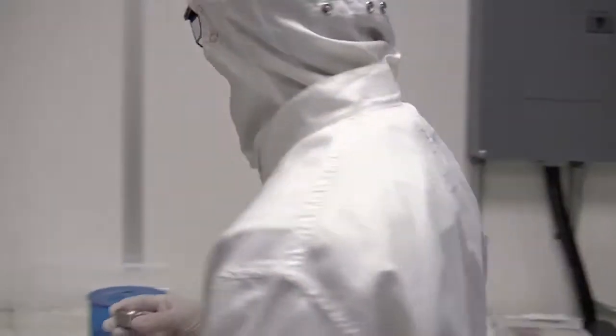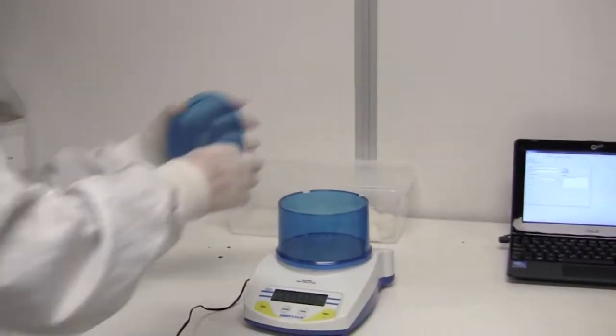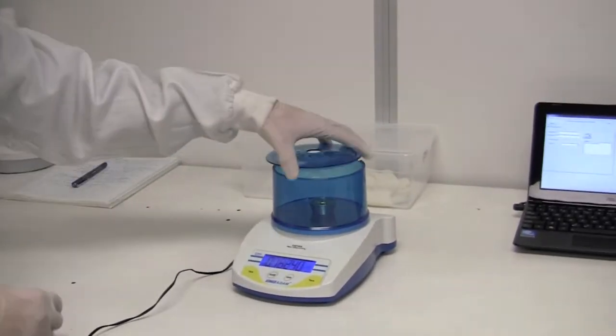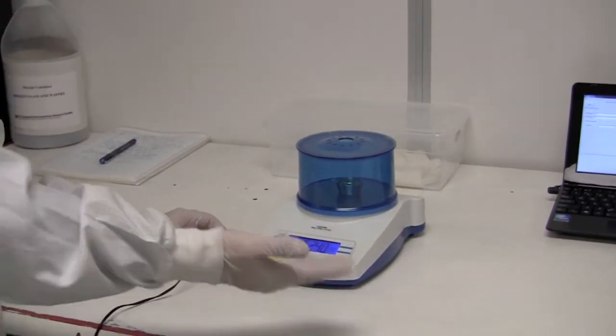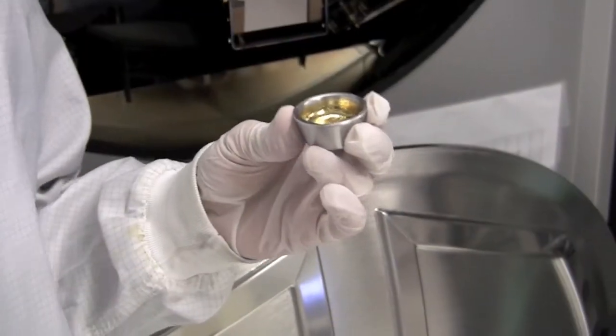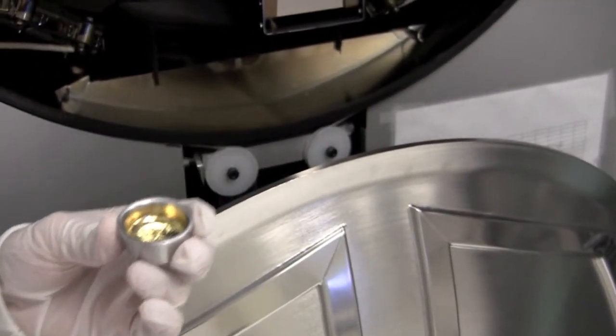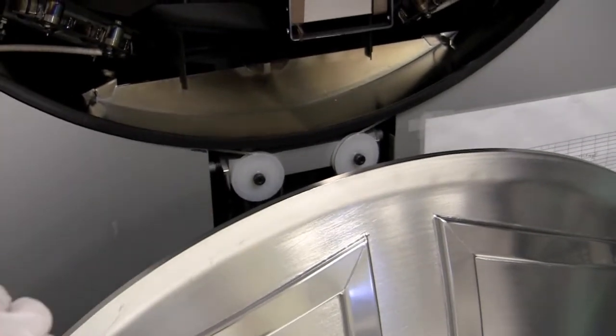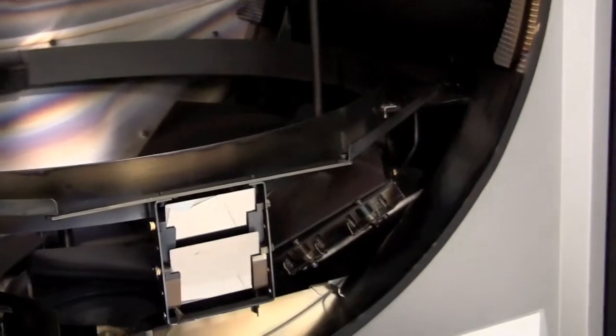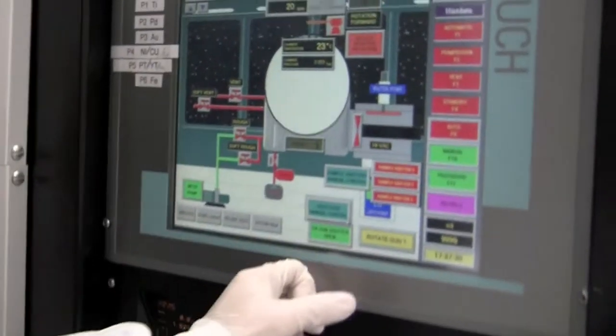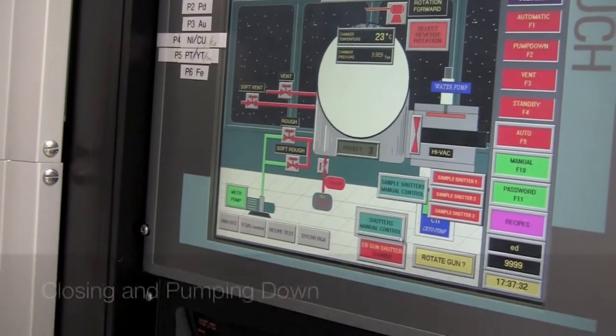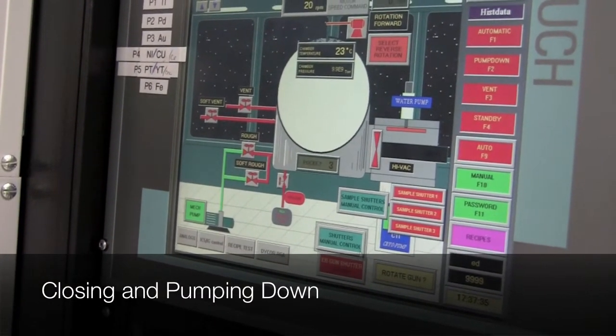And now I'll come over and I'll measure the gold. Record the value of the gold mass in the logbook. After I have measured out the gold I can put the crucible back into the evaporator. And once again I want to make sure that that carbon spacer is in there, making sure that the crucible is nice and flat. I can push the shutter button to close the shutter again. And now I'm ready to close the chamber door.